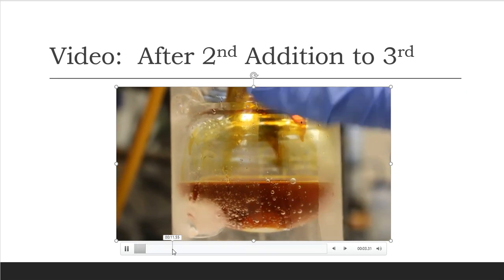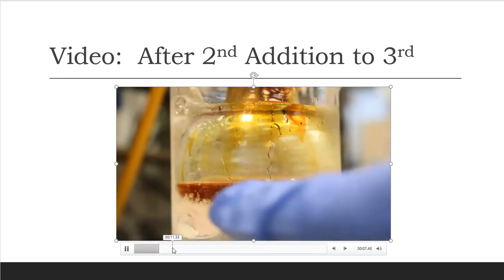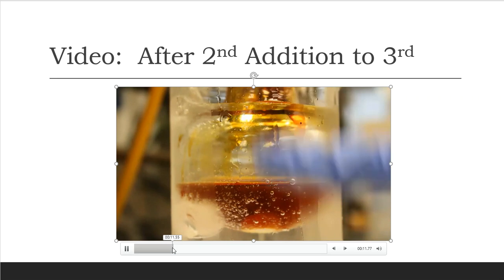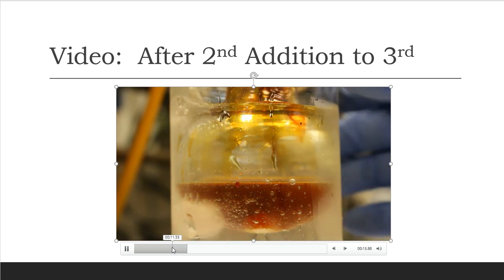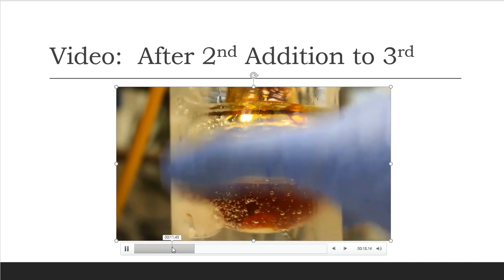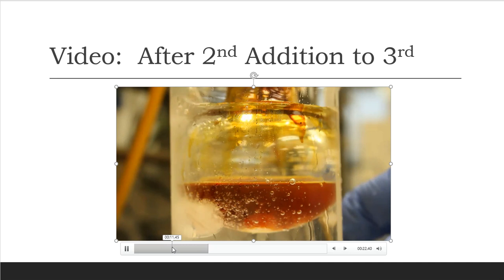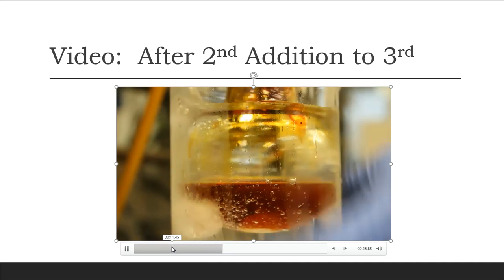Okay, so what you're seeing here is the second addition. And after 5 minutes, this is still a really dark color. It did not lighten up like the first one did. And that's okay. Sometimes over the course of these additions, it just becomes more and more stubborn. That's why in the procedure it says, if after 5 minutes it does not get lighter, you need to go ahead and add more anyway. And that's what I'm getting ready to do.